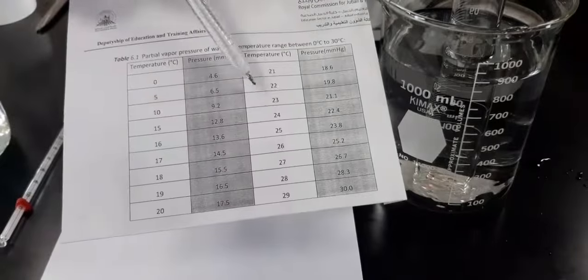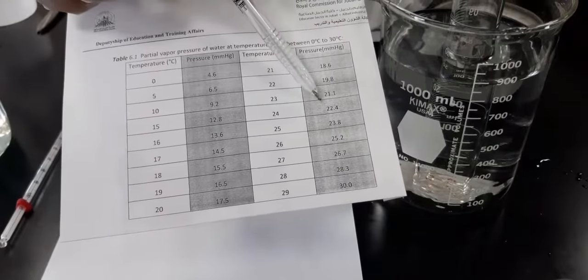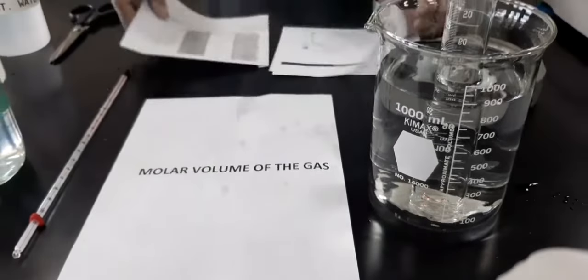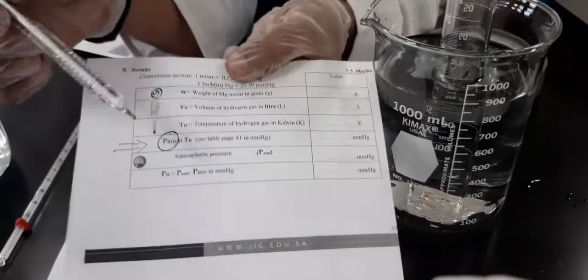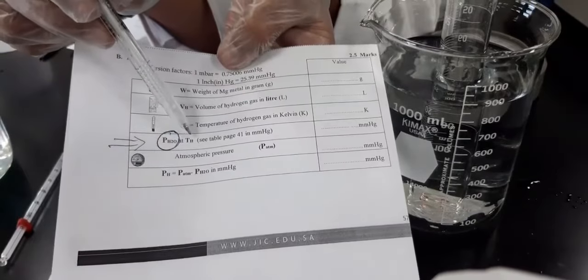So for us, the temperature was 24. Okay, and the pressure of water at 24 Celsius is 22.4. So this 22.4 will be written in the first line of this column, pressure of water at TH.